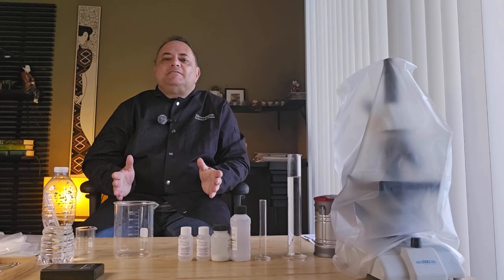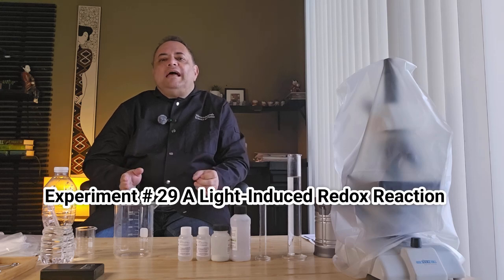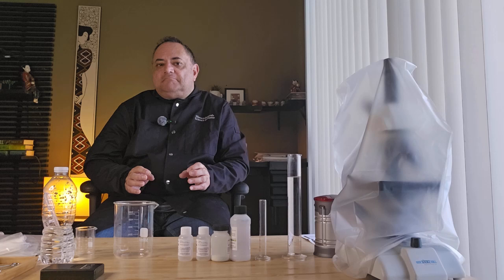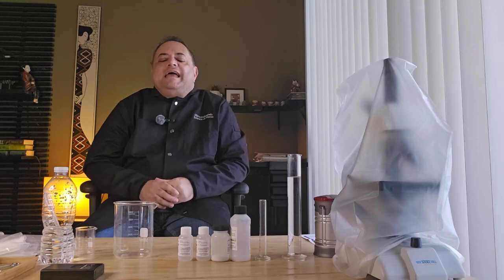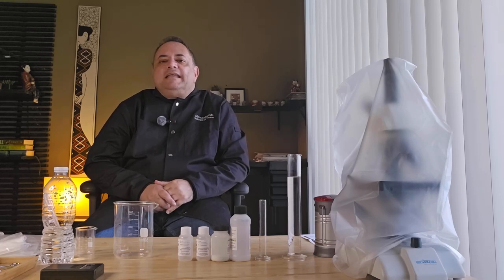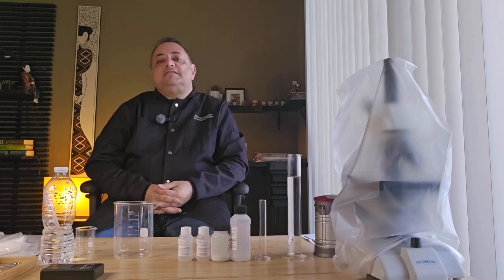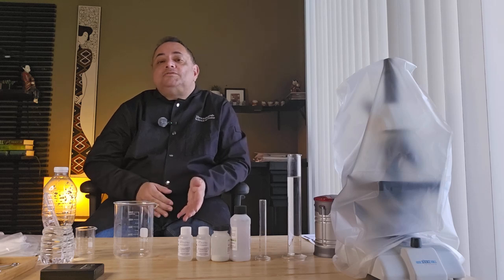In today's episode, we're going to look at the thionin-iron complex light-induced redox reaction. The thionin-iron complex redox reaction is strongly affected by light because thionin is a photoredox dye. Light can drive electron transfer that is slow or impossible in the dark.